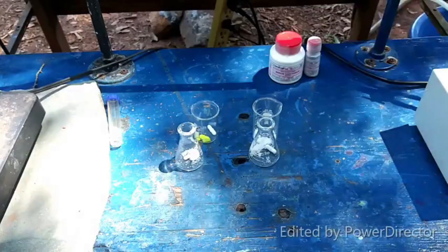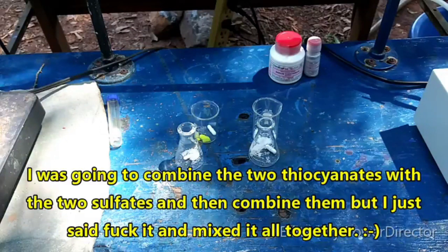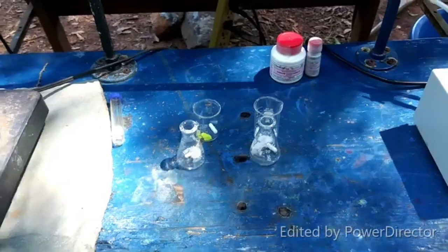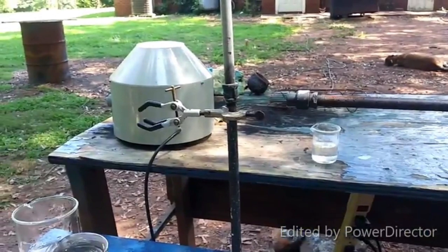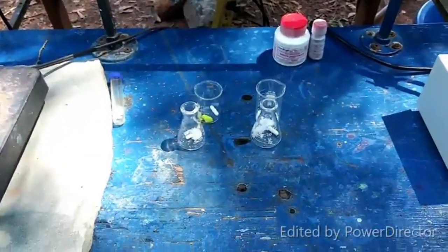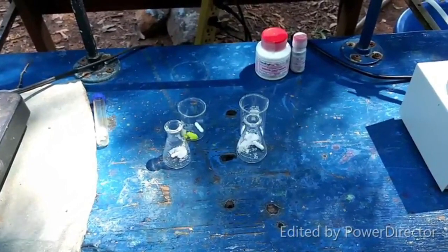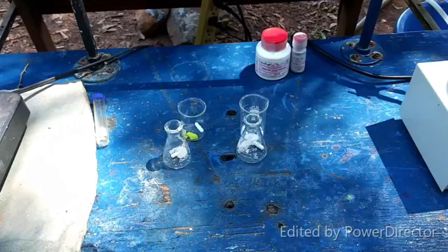And more barium thiocyanate. What I'm going to do now is dissolve all of these in a minimal amount of hot water. Then I'm going to combine them all together. Then I'm going to bust out the, well, it's already busted out, the handy dandy old centrifuge. I'm going to remove the barium sulfate. And then that should give us our solution of our compound.